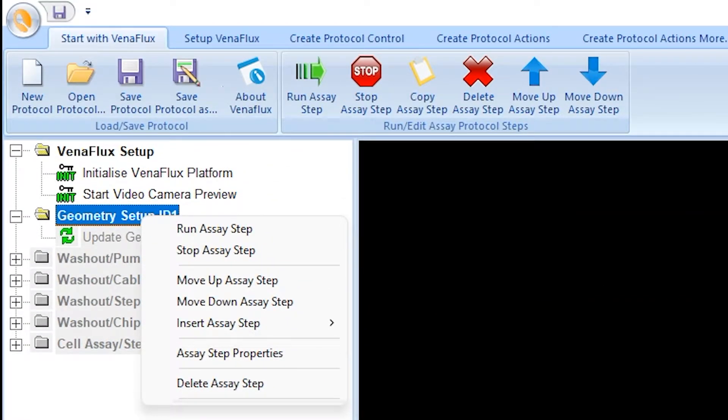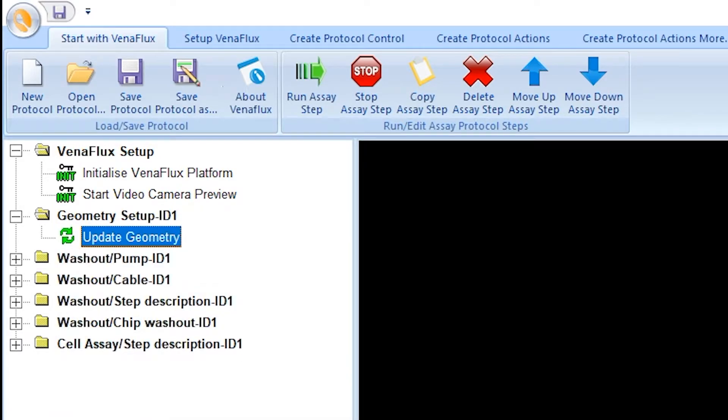Right click on Geometry setup and click Run assay step, or click Run assay step with the green arrow from the menu. The geometry of the biochip has now been set.